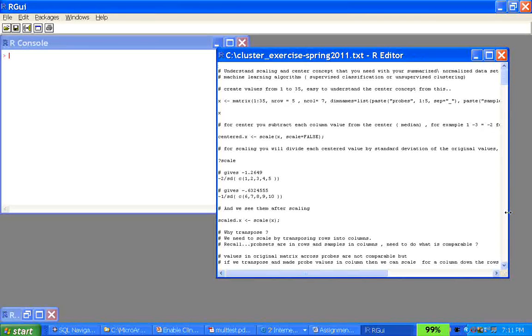You just force those columns to be normally distributed, and the technique is called centering and scaling. Then you feed it to your algorithm of hierarchical clustering or support vector machine or neural network. It's a whole course on it. I took it from ePoly, probably the best course I've taken from Poly. So if you can, take it.